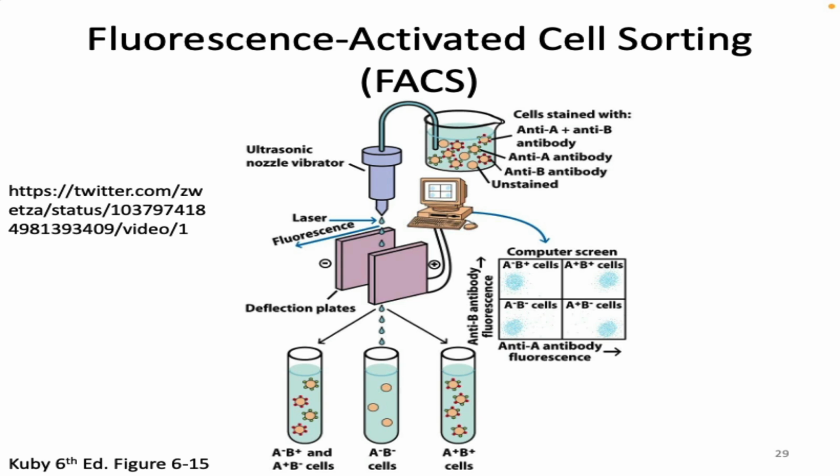and then it's going to take these two plates here and switch around the electrical charges to make the droplet fall in a different direction. And so, in fact, the cells can be sorted based on the proteins that they have. And I can get collections of cells with only one color, or cells with two colors, or cells with 0 colors from sorting with my machine.